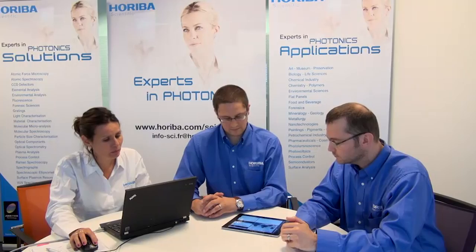There are some possibilities probably in the future with the gated CCD, but for the moment it's not what we want to use. If you are interested, just let us know. It will be interesting for us to know if it's something in which you find some interest, for sure. And what is the sensitivity of CCD compared to PMT?